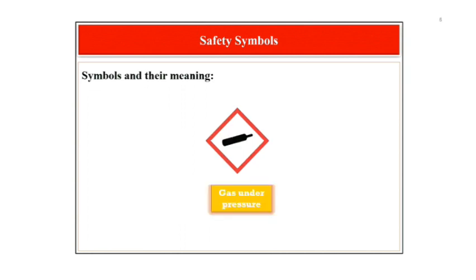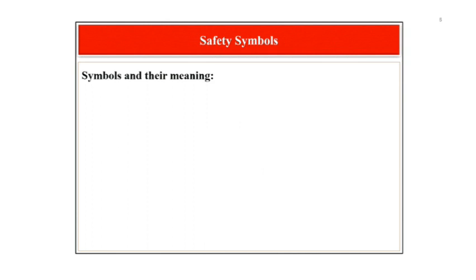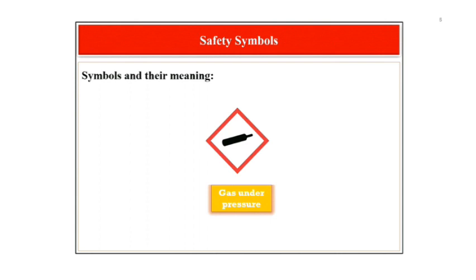The next symbol is the symbol for gas under pressure. Compressed gases, as indicated by the symbol, are routinely used in laboratories. There are three major types of gases stored under pressure in cylinders: liquefied gases, non-liquefied gases and dissolved gases. The high pressure within a cylinder makes compressed gases hazardous, as gas can flow rapidly from the cylinder and cause injury, fires or explosion.